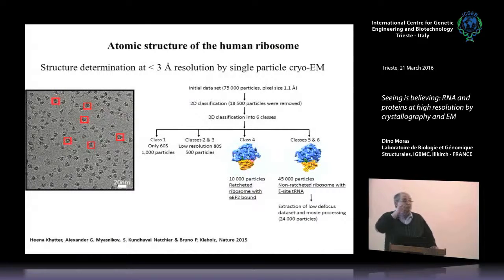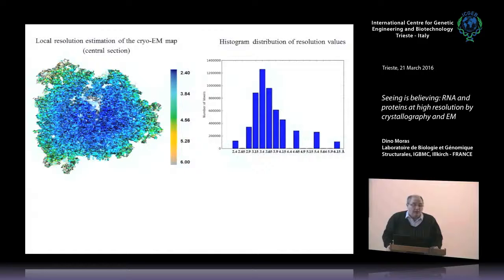And you can see a complex in one given state and another complex within the same cell, because you have an equilibrium where you have part of it missing or a different conformation. So a mixture, but within the same thing. You have taken your mixture and you look at all the components, provided you have enough things. And then, of course, one thing that you should look at when you look at the papers.